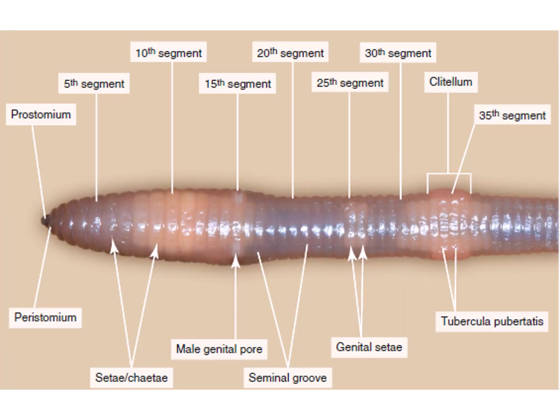In the earthworm, we can observe reproductive openings. The earthworms are monoecious, meaning they contain both male and female reproductive systems. However, they cannot self fertilize, meaning their sperm cannot fertilize their own eggs, so they have to get sperm from another individual and transfer their own sperm to another individual.